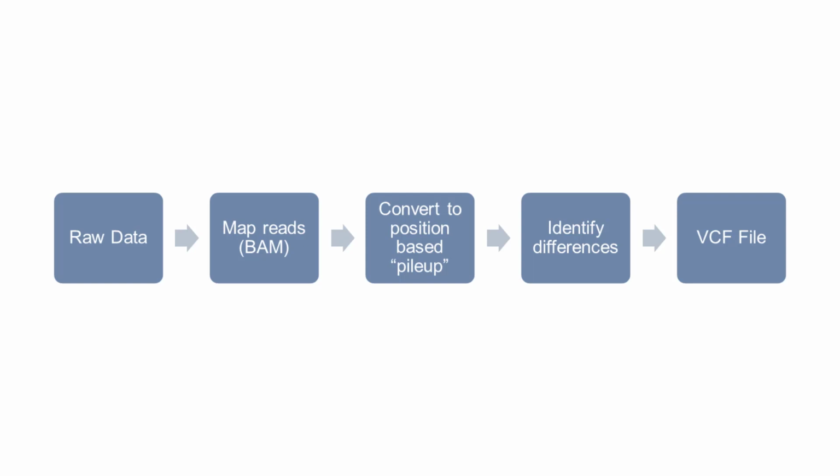In the next steps we have to convert this into a position-based pileup file, which is a file that lists all identified bases per position. Next we have to identify the differences from that list and create a VCF file.